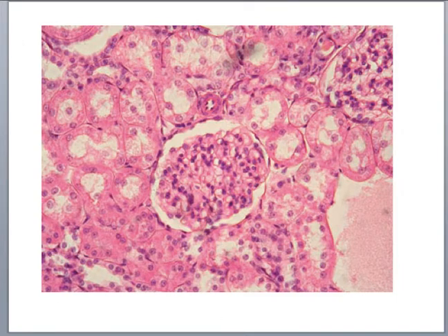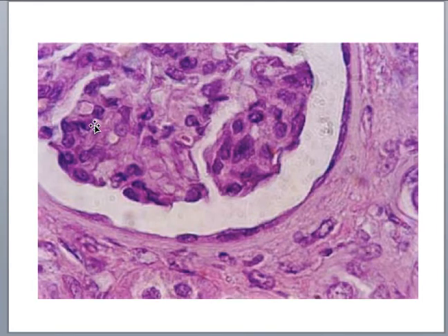Now, if you want to test if you can find simple squamous on a more challenging slide, this is actually from the kidney. When you're looking at the kidney and you're going on higher magnification, you'll see these little balls. These are glomeruli from the kidney, and this is a tuft of capillaries. There's this space, and lining it you'll see a single layer of flattened cells. That's simple squamous epithelium. So higher magnification: here's that tuft of capillaries, here's that space, and here, this is simple squamous epithelium.